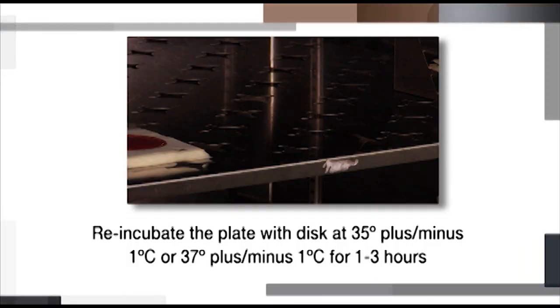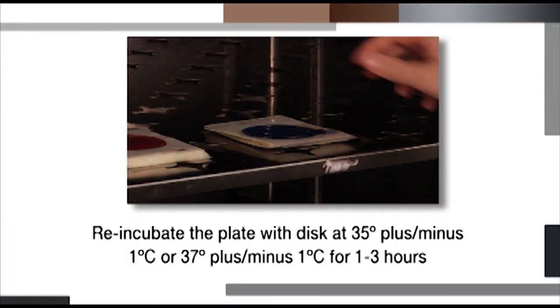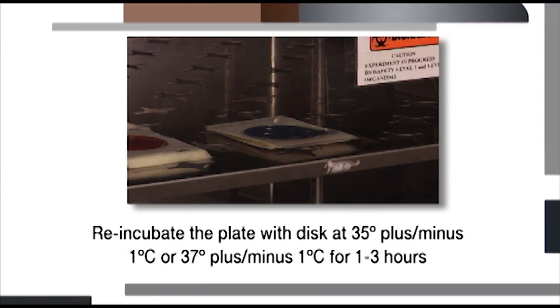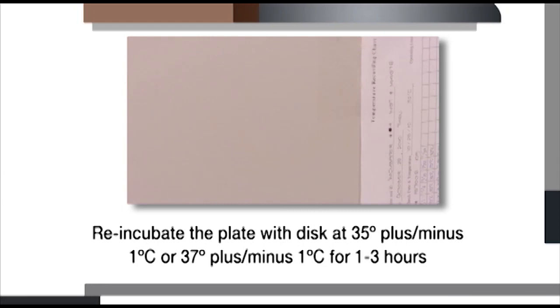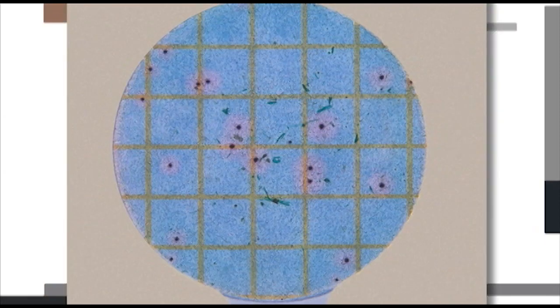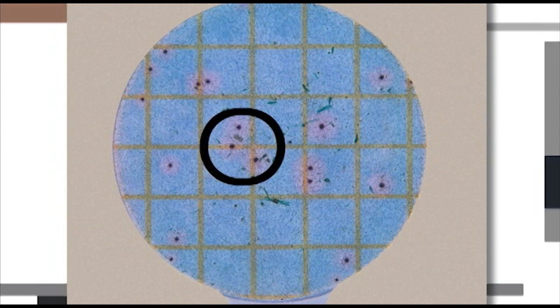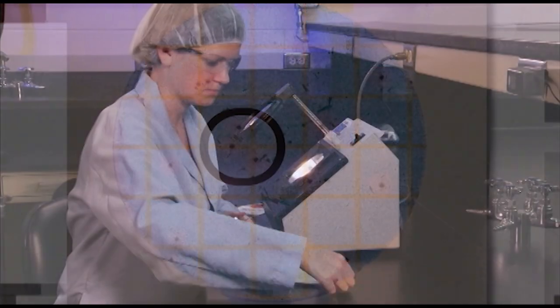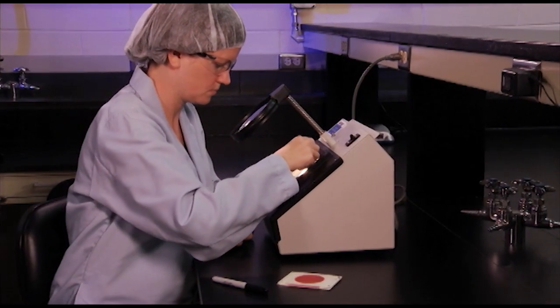Re-incubate the plate with disc at 35 plus or minus 1 degree Celsius or 37 plus or minus 1 degree Celsius for 1 to 3 hours. An indicator in the Staph Express Disc causes the Staph aureus colonies to develop a pink zone surrounding the colony. After re-incubating the plate and disc for 1 to no more than 3 hours, count colonies with pink zones as Staph aureus. Good lighting is necessary for accurate counting.